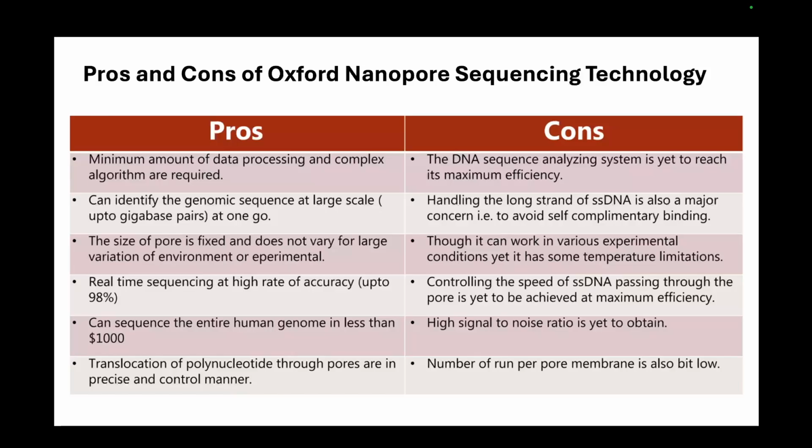A lot of you will say this is not great because you've seen 99% and above accuracy in previous cases, but you have to consider that the reads are very long, and there is a trade-off between accuracy and the length of the read. If you are getting a 10 times bigger read with 1% less accuracy, I think that is a good trade-off to have.